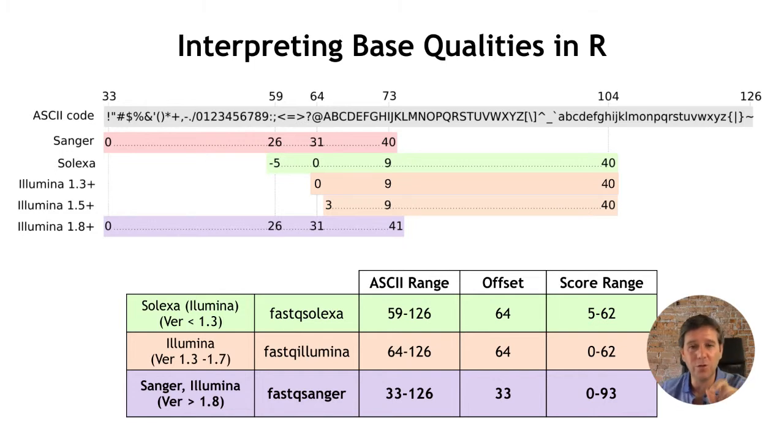And the reason we use one character, of course, is because we want to keep that straightforward correspondence between the quality of this individual base, which is one character, nucleotide C, right? We don't want to write, we're 99.9% certain it's correct, because that would be lots of characters, and then we lose the correspondence between character and quality score. So we use this way to encode those numbers.